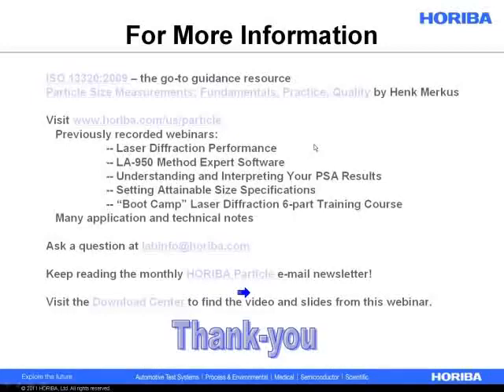We can continue the discussion through email offline, but if in the LA950 we use a 650 nanometer red laser diode, and you give me a 650 nanometer standard, the LA950 should be able to hit it right on the nose. So that's really what some of these questions boil down to. I can give you a theoretical explanation, I can give you my best guess, but the proof is in the pudding. If the analyzer can't give you the right answer at sizes near the wavelengths of light being used, then it's just so much more talking on my part.